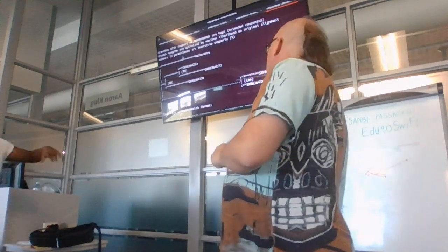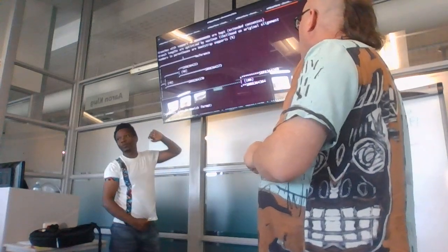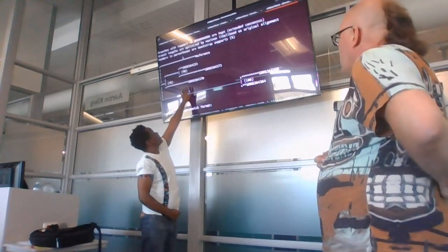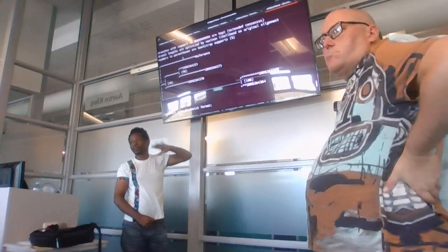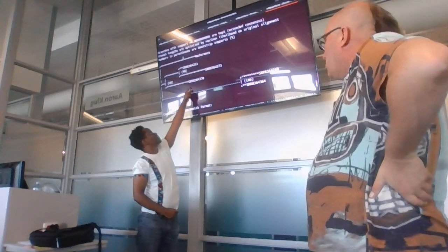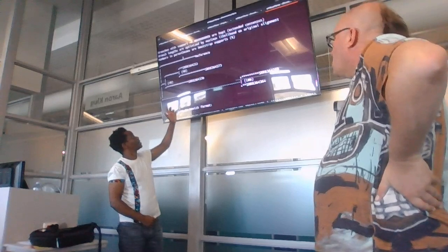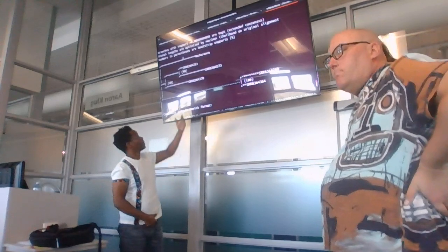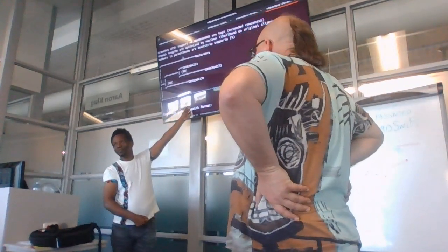If you took one of these as a reference, for example, and you argue this is my reference, what do you think will happen? If you took, for example, this is the most different one. I could redraw this and use this as a reference. If I assemble that genome, I could use this. It's the most sort of far back in this context. But also you have to remember in how you're interpreting it is you have to have other data, other metadata. So my quick question would just be, is that from the same location?